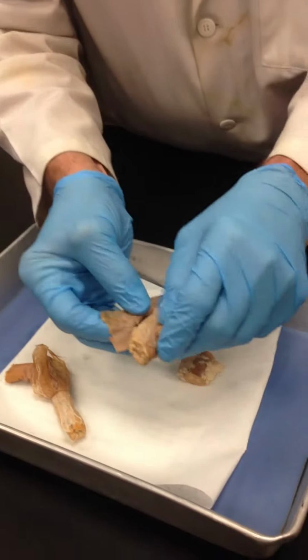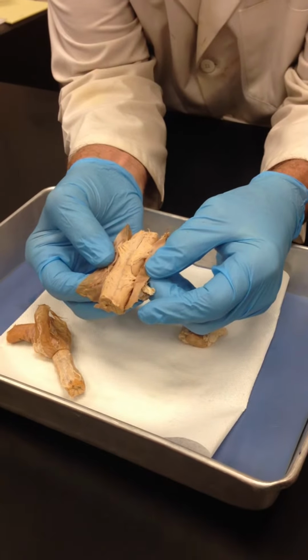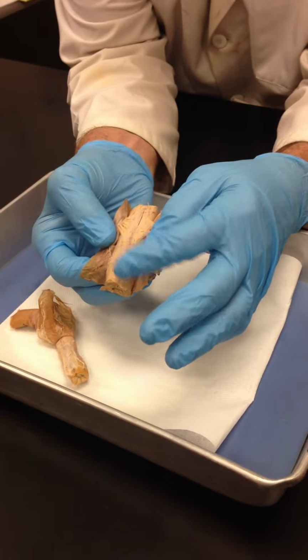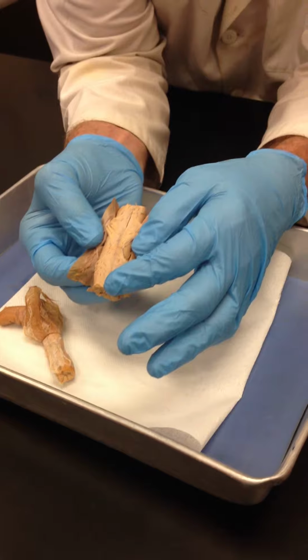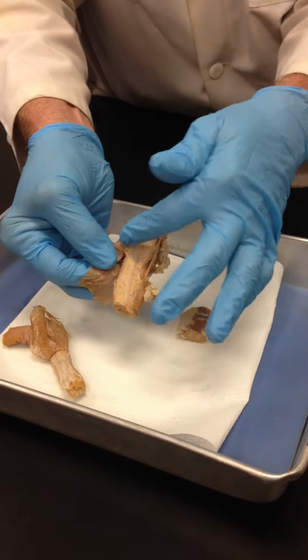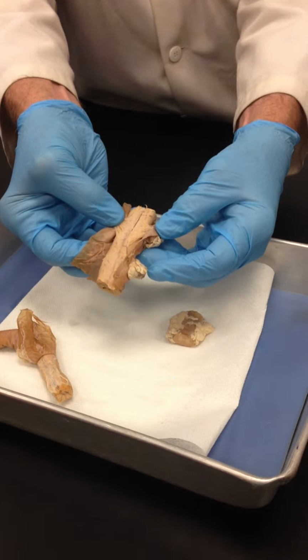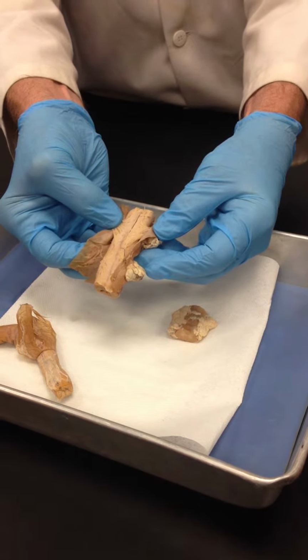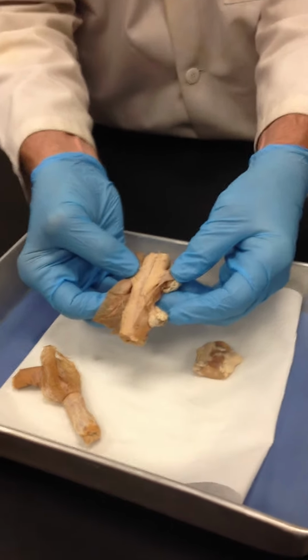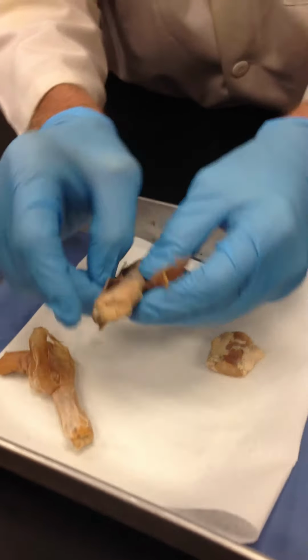So if you were to see this piece of spinal cord as a test resource, if you note that the spinal artery is visible, you know by default this has to be the anterior or ventral side of the cord. Consequently, you would be able to infer this nervous tissue that you can see here and here. Is that going to be facilitating motor or sensory information? Motor, isn't it? Because motor is always on the ventral side, as opposed to the posterior or dorsal side.